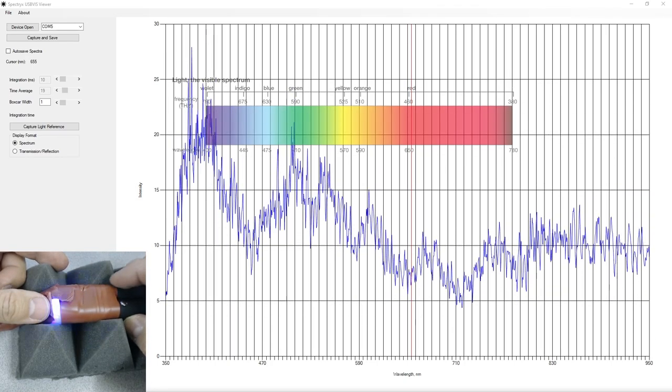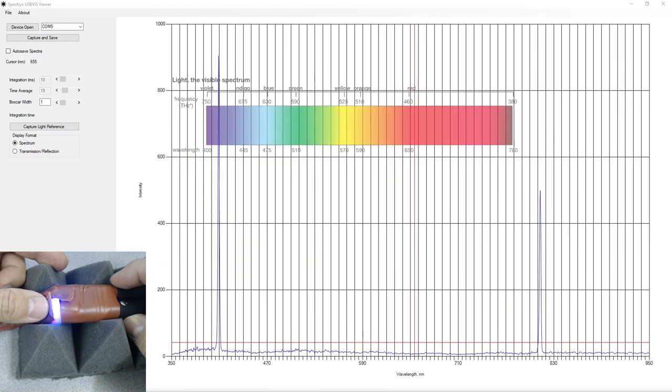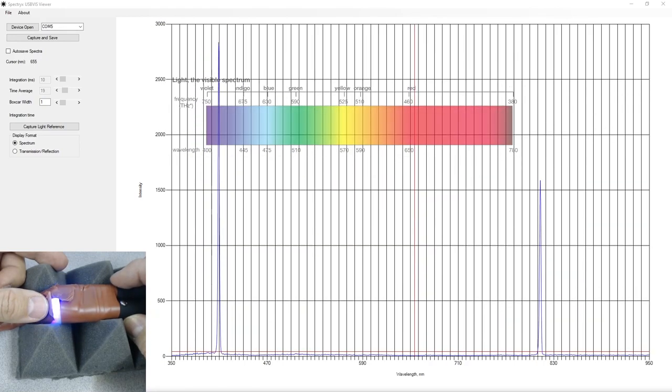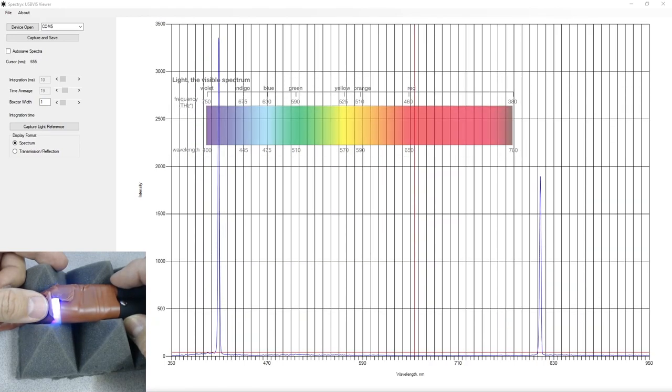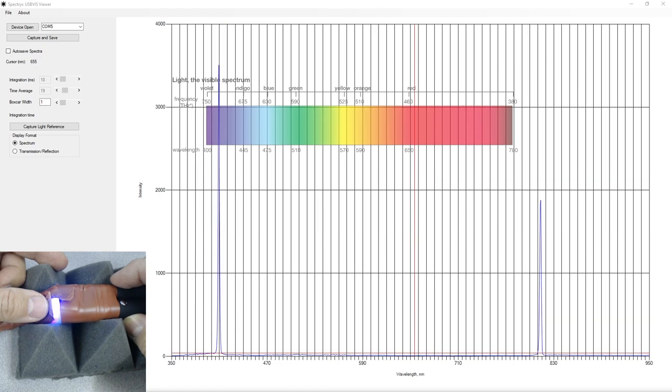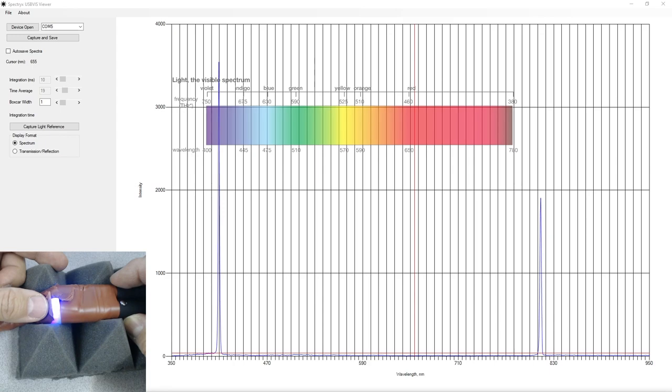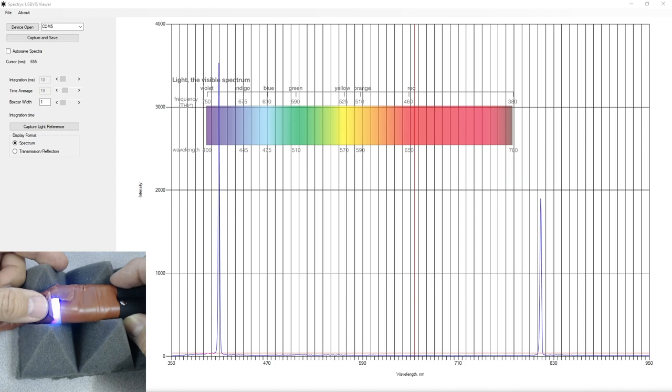So let's go for the blue. That's the blue. Now you'll see that there is a peak in the infrared over there to the right. And we saw this with the blue LEDs from the Samsung S7 when we looked at the screen from that. And the blue here is very much lower intensity than the green or the red lasers. Anyway, so that is the blue LED there.